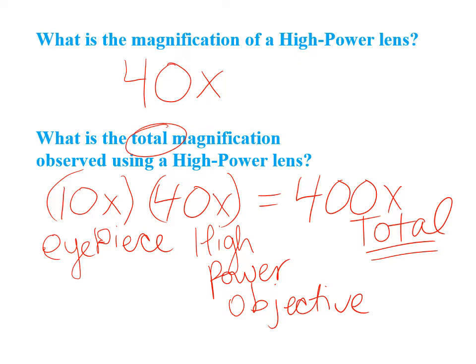Okay, so magnification of a single lens versus total. Make sure you always include that eyepiece or ocular magnification. Again, if you have any questions or need any help, just contact me on Remind. You'll see more of these kinds of questions pop up on quizzes, on post labs and whatnot. If you want a little extra practice, just ask me on Remind.